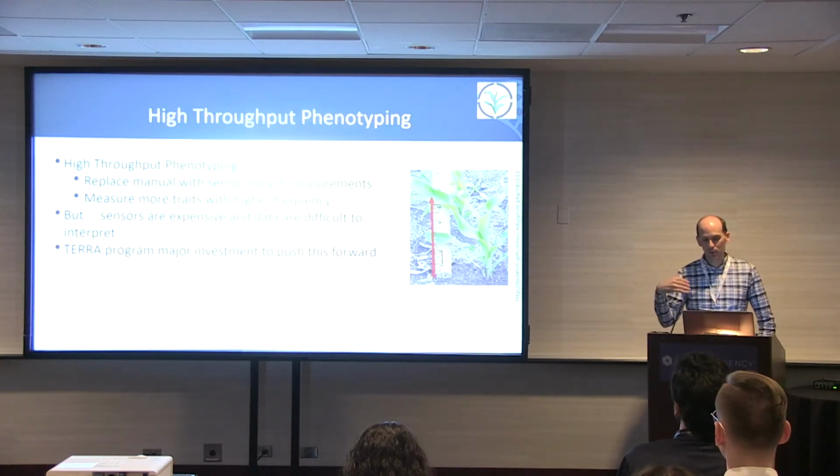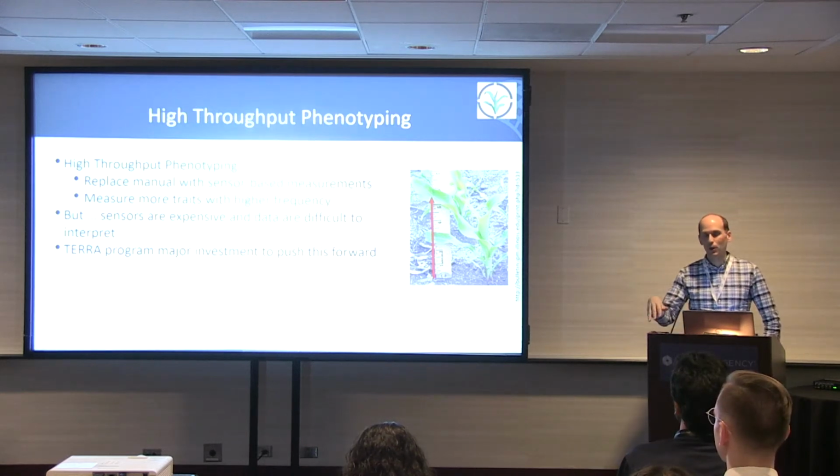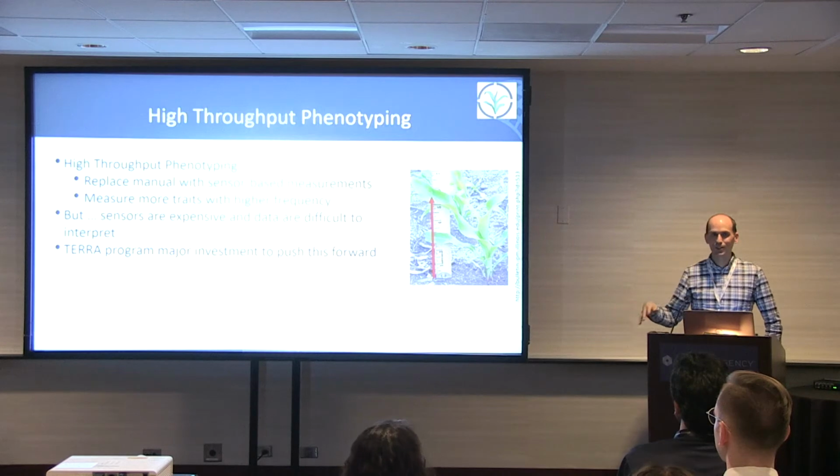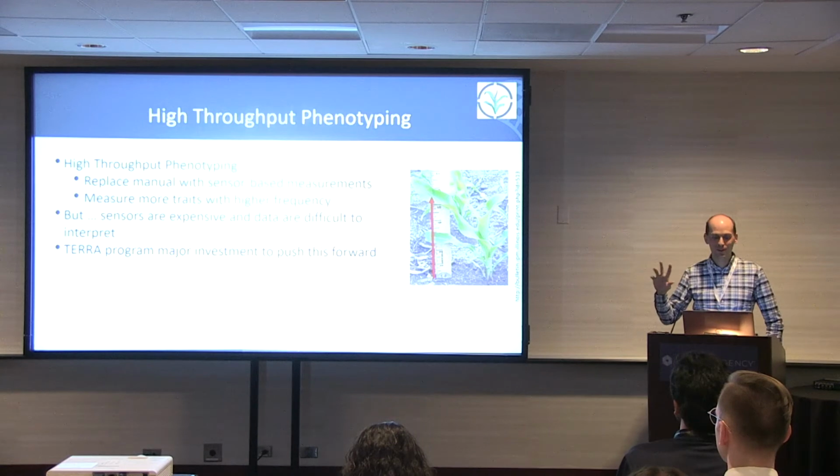So the space we work in, this high throughput phenotyping, this is where David and I want to work on the computer. We don't want to go out to the field and measure plants. So we want to be able to measure plant shape, physiology, morphology with remote sensing.